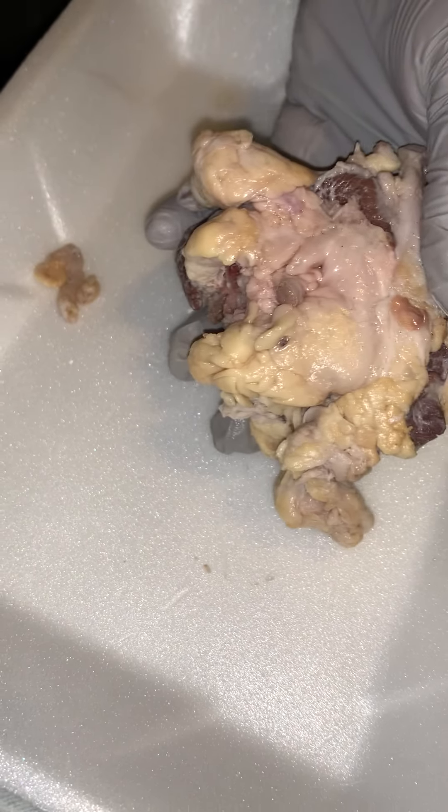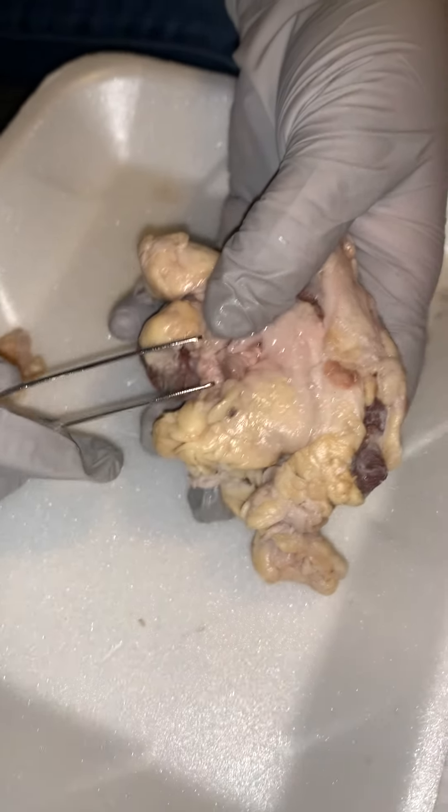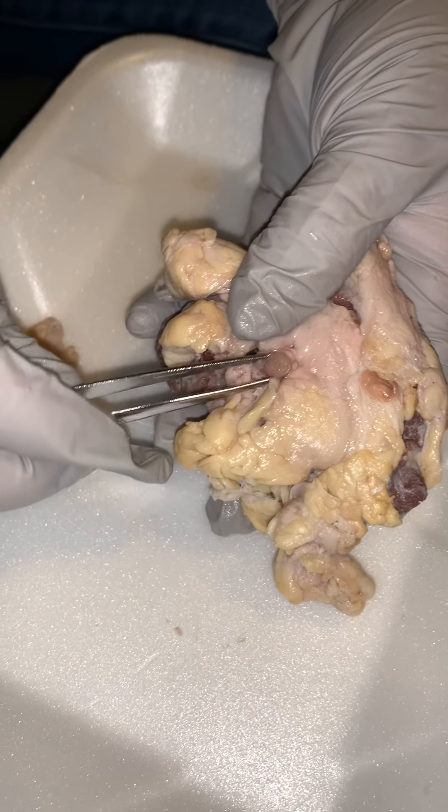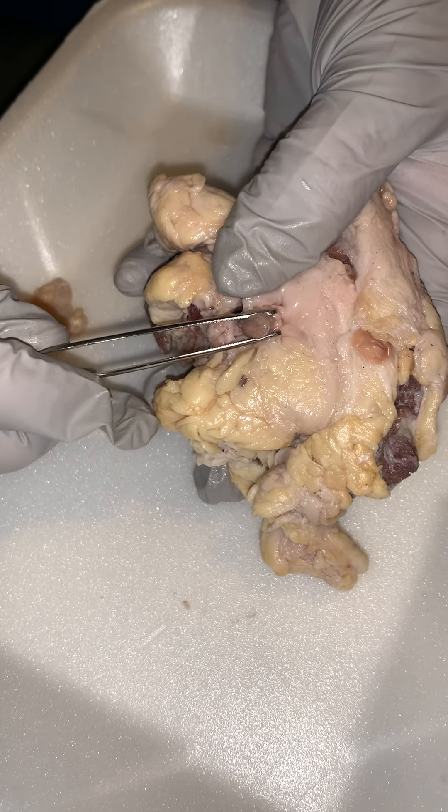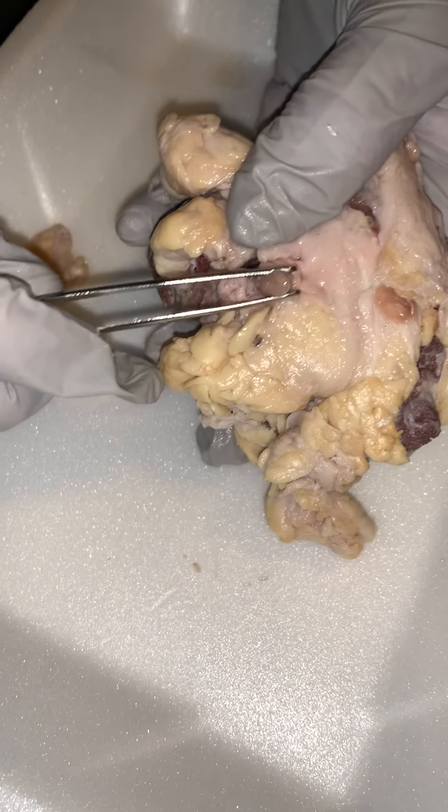And right there is our optic nerve. Really tough little structure, the optic nerve.